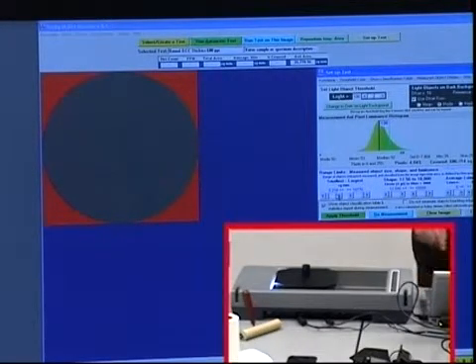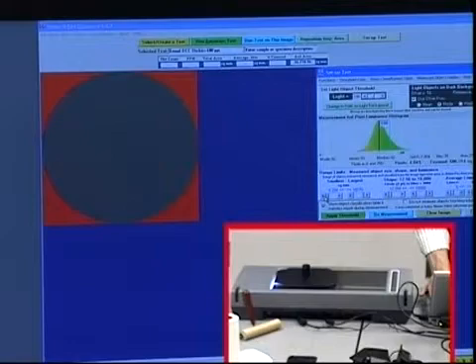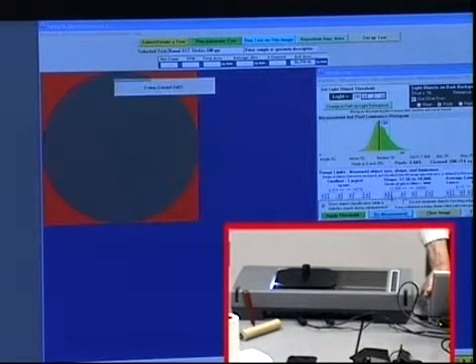Now these stickies are generally very large. Small anomalies we're not interested in. If they're very small specks, we'll limit our investigation to objects that are greater than 2.25 square millimeters. Yeah, good. We'll do the measurement, we'll test it out.